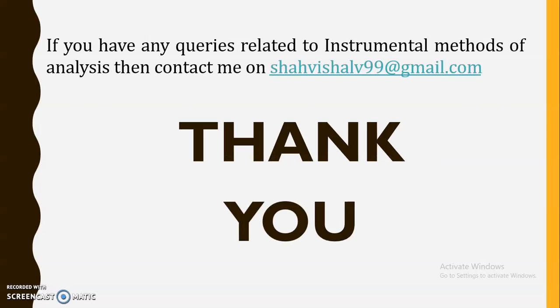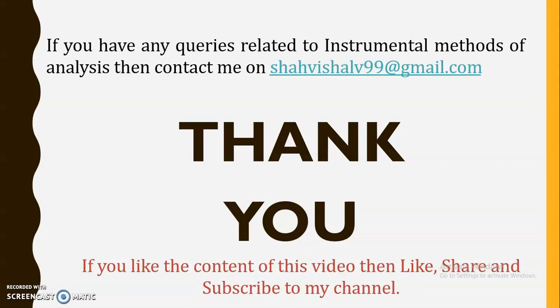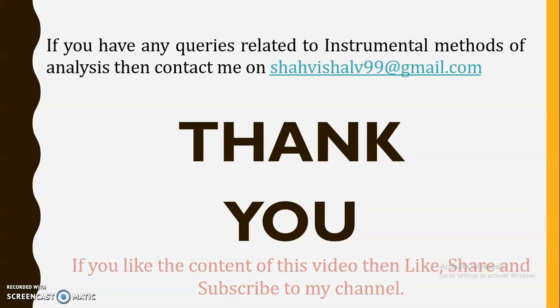So in this video in detail we have discussed two radiation sources. Further, we have also covered the different monochromator systems that are used in IR spectroscopy.